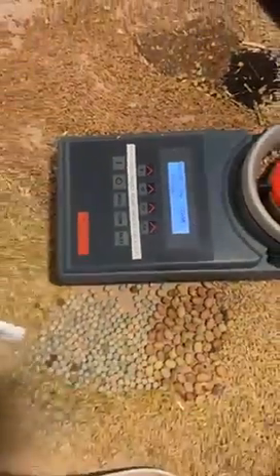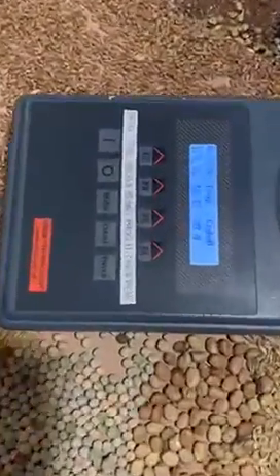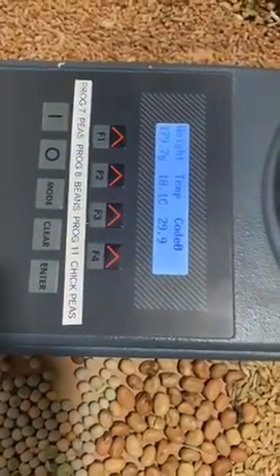Press enter to confirm and now hold down F2 to complete the calibration. The machine will then test and give you the readings. The machine is now fully calibrated.